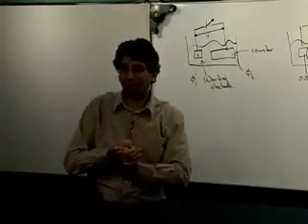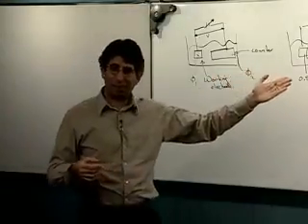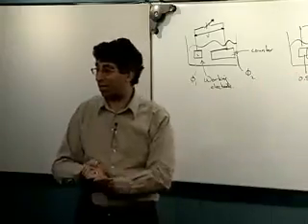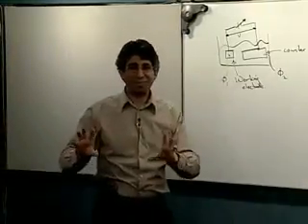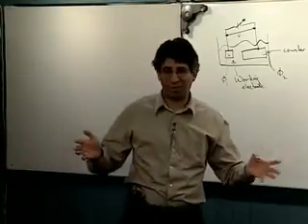and there I am, and I know everything there is to know about electrochemistry, of course, and so these guys, you know, back in 1960 with their lead acid battery, it was a power supply actually, got 50%. I had my fancy brand new potentiostat and my air-free cells, and really know what I'm doing, so I'm going to do this the right way and get 100% yield of this wonderful product.